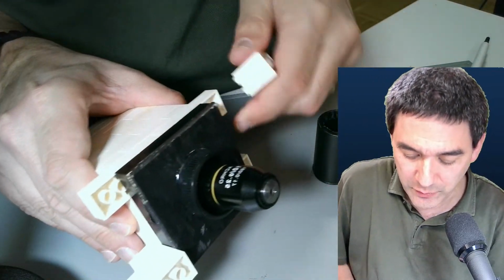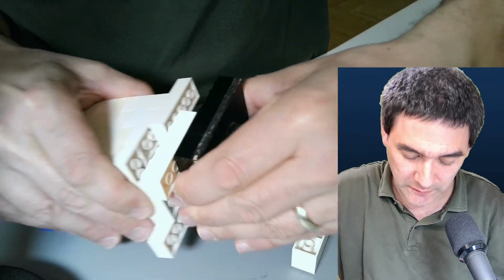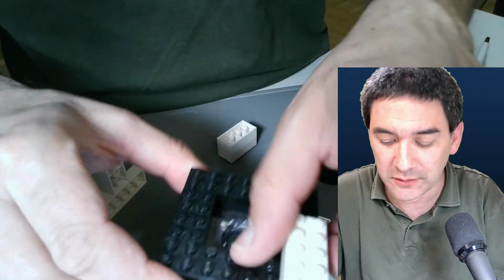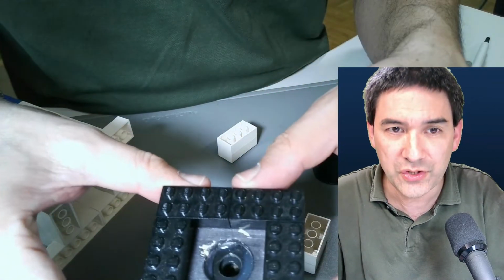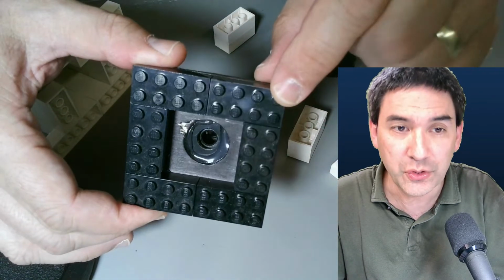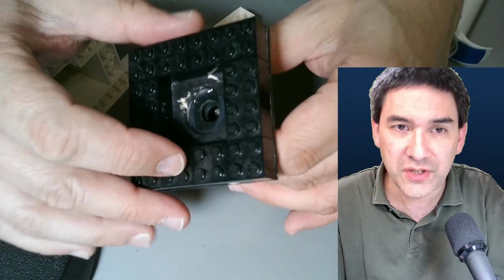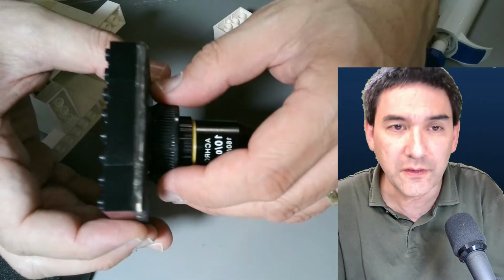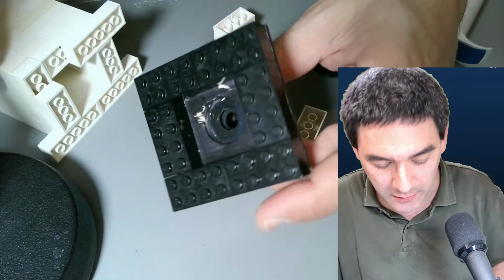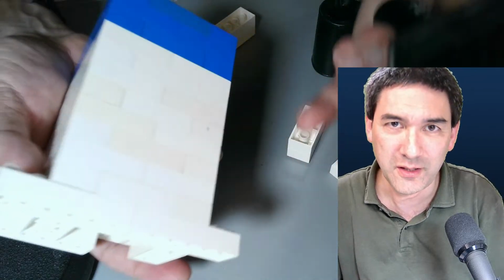Can I even remove this? I have to be careful here. Okay, here we go, this is how it looks. There is some plywood here, and I used some hot glue to connect the first layer of Lego pieces. I know that some folks have 3D printed certain things here, and it's not the first time that somebody's making a microscope out of Lego, but all you gotta do is cut it with plywood.